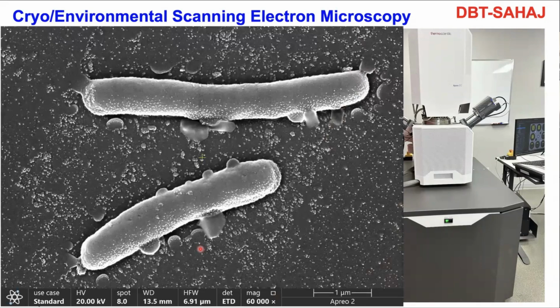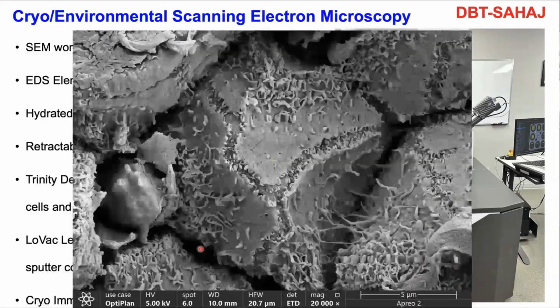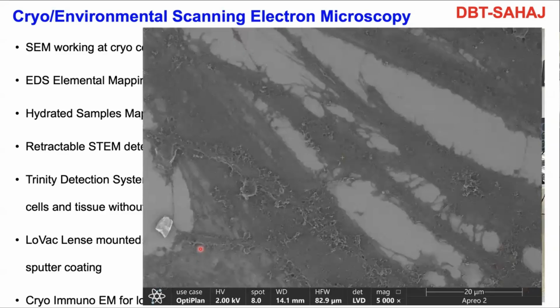These are bone marrow cells from patient samples, and with higher resolution you can detect everything. Here you can also go for 3D imaging, but there are limits, and you cannot get the internal structures. The TEM grid we can view with this as well. Fibroblast cells grown on the surface look very nice. You can see the projections and everything by using the environmental mode and cryo-electron microscopy mode with this machine.